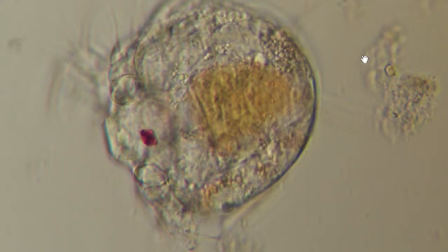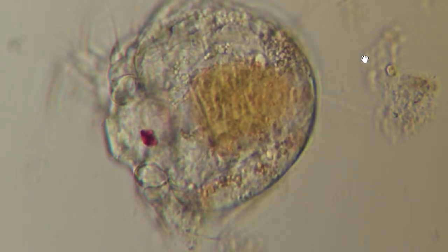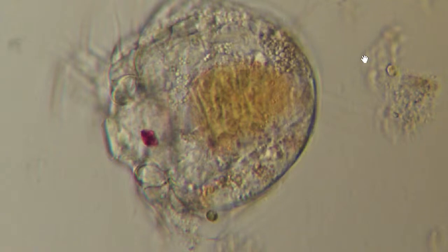You'll often find these guys where the guts aren't moving because they just died. And if you watch long enough, they will eventually rupture through osmotic pressure. And then there's bacteria swarming around them, and it's a big old party.